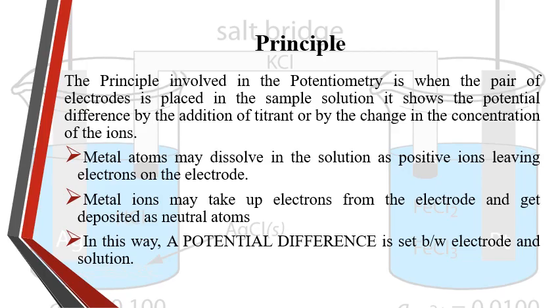It is like a regular titration, but instead of the indicator, we use the potentiometer. It measures the changes in potential and can be used in all kinds of titration like the acid-base titration, redox titration, complexometry, and so on.